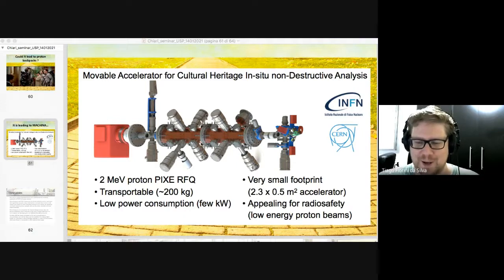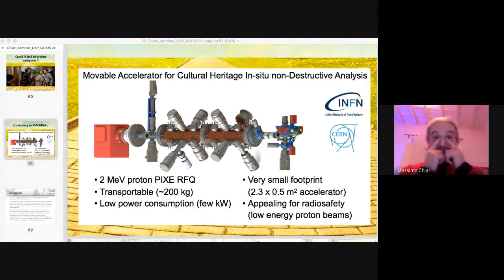I see a lot of developments, but I just want a general picture of what's your opinion about the future of IBA. Most of the more striking technological development will be for my colleagues trying to design other portable accelerators. There is also already the idea to try to extract a microbeam, not only millibeam.